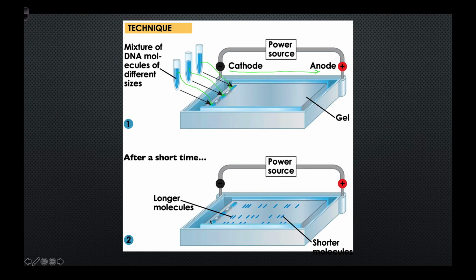Now, how did we get to all of these fragments of DNA? Remember that with our DNA samples, we add restriction enzymes to them that cut them in specific places. So ultimately what we have is a vial here of DNA that's made of very small segments of DNA, medium-sized fragments, and large fragments as well, based on what fragments are left over after a restriction enzyme makes its cut of those samples.